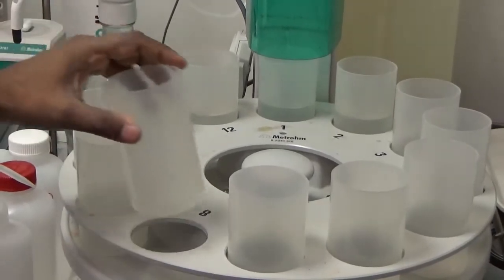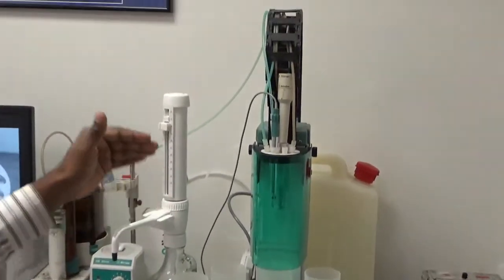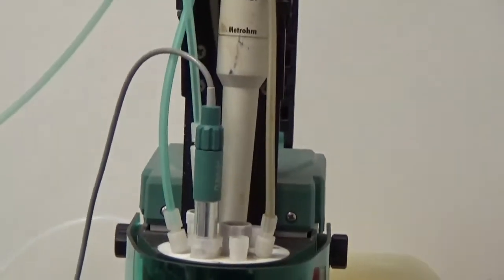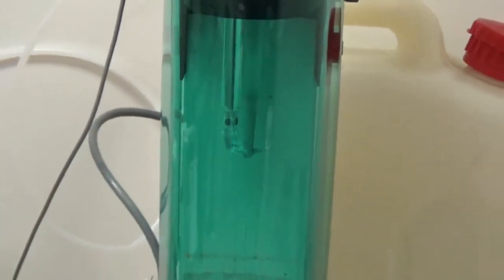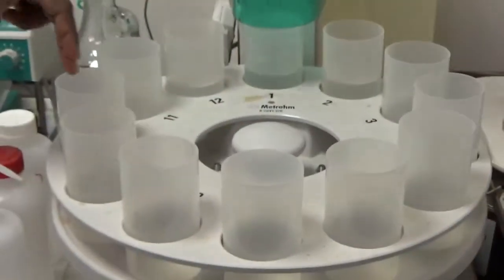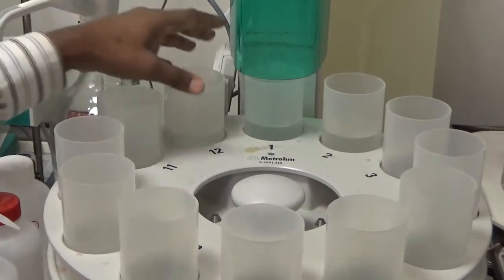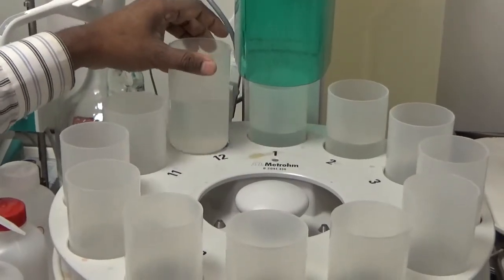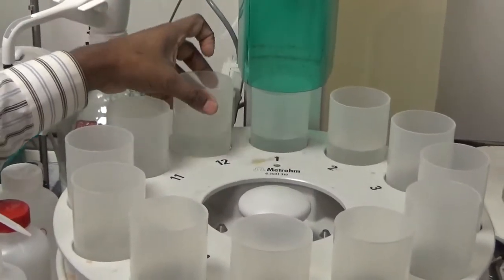The 751 GDP Titrino is attached to a 730 sample changer, which comes with a 12-position sample rack where we put 250 milliliter plastic beakers. The tower moves the electrode and the buret up and down — when up it's the home position, in the middle it's the lift position, and when it goes down to the beaker it's the work position.